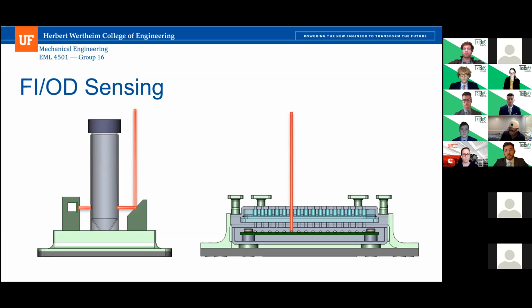What's cool about that is if I want to move down to a 6 well plate, or something less than 384, there's always going to be a photodiode located within the range of the laser moving through it.